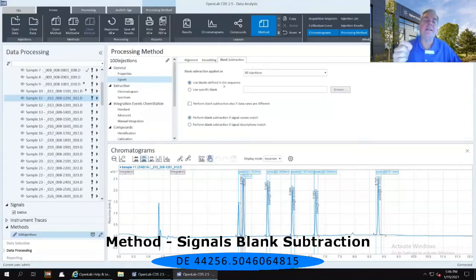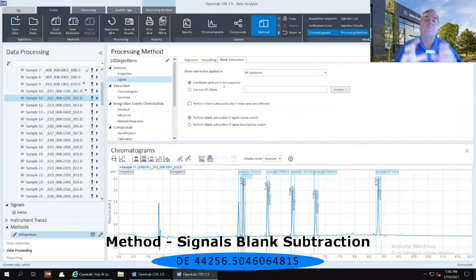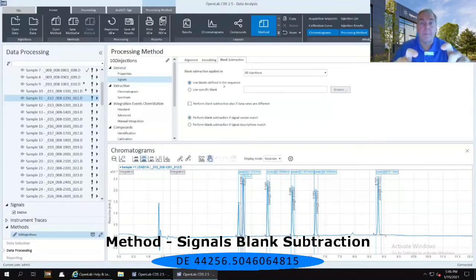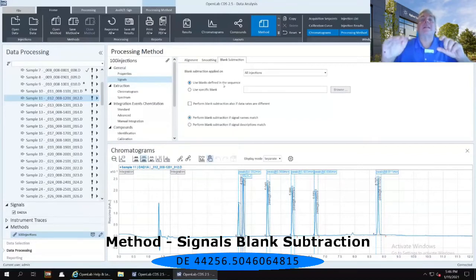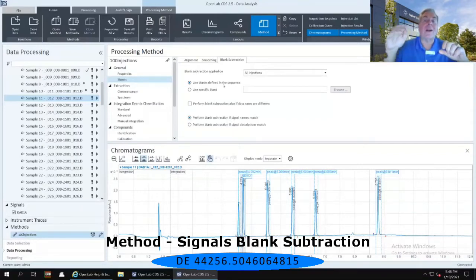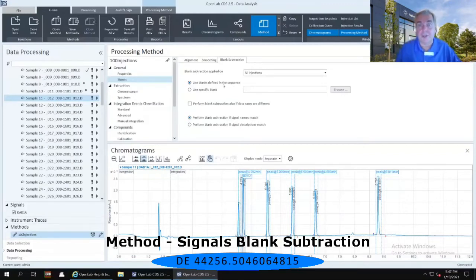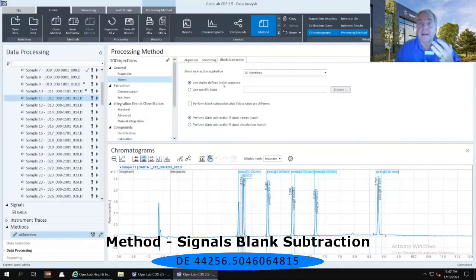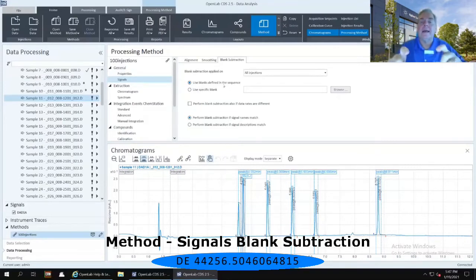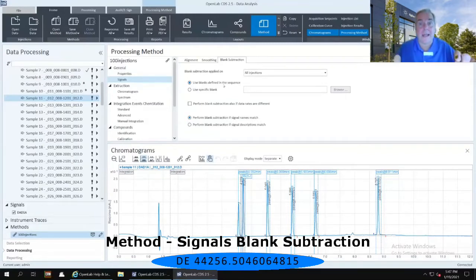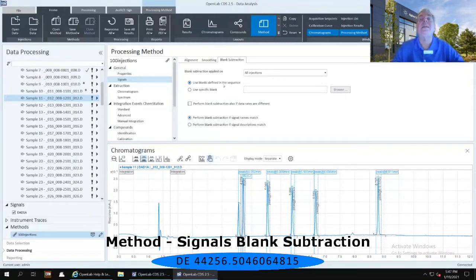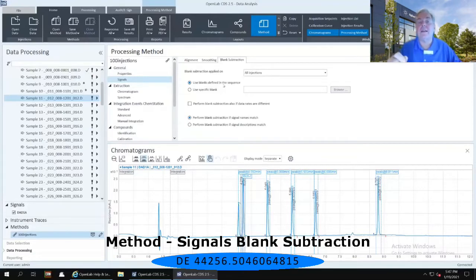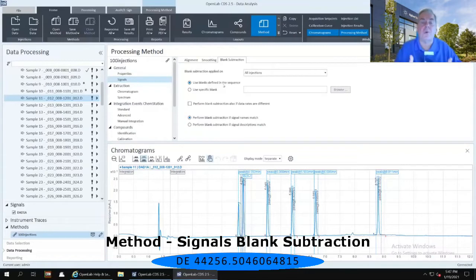It is going to take the blank that is closest to the samples that it's going to be subtracting from, but that was already injected and already acquired prior to those samples. So in that example that I just gave you, it's going to use the first blank to subtract from each one of the ten samples immediately following it. It's then going to use the second blank to subtract from the second set of ten injections immediately following that.